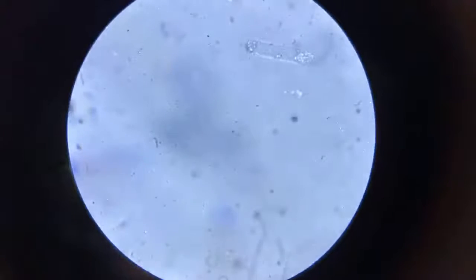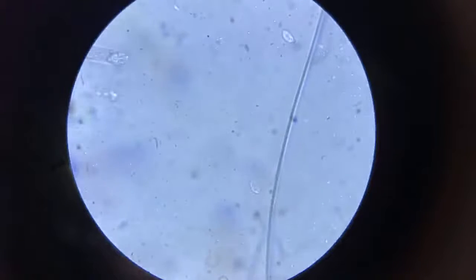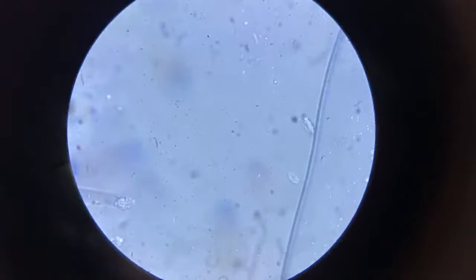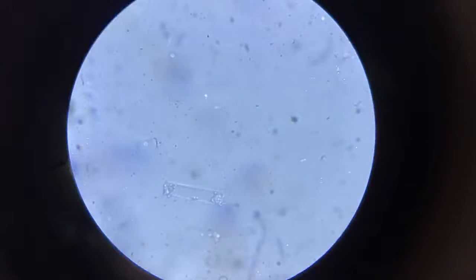The water film is closing in from nearby. Here, this water film is receding, and as it does so, it is constraining this environment.